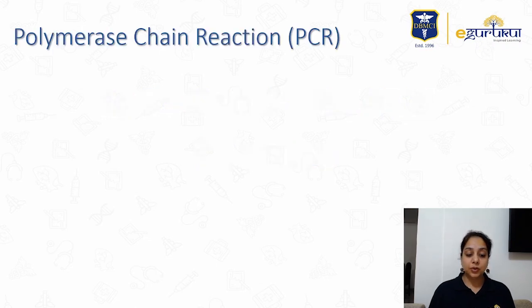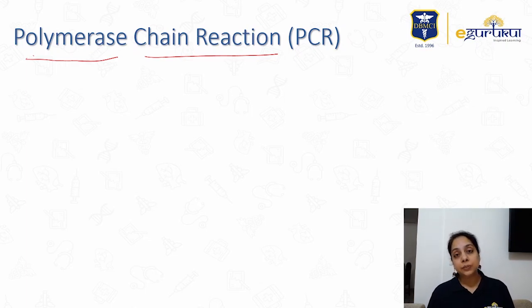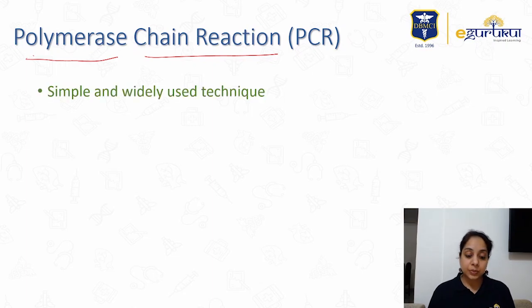Let's start our journey for SARS-CoV-2 and the real-time RT PCR as well as the CT value. So first of all, what is PCR? You can say the origin of RT PCR came from PCR. PCR stands for polymerase chain reaction. As the name suggests, there is a polymerase, like the DNA polymerase, RNA polymerase, you all know, and there is a chain reaction going on repetitively over a period of time, and that we calculate over the graph that gives us the PCR.